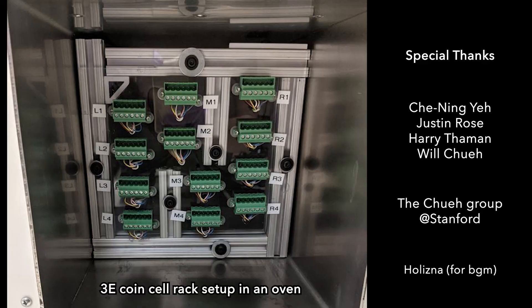Okay, that concludes the assembly demo and I hope you have fun making three-electrode coin cells. Bye-bye.